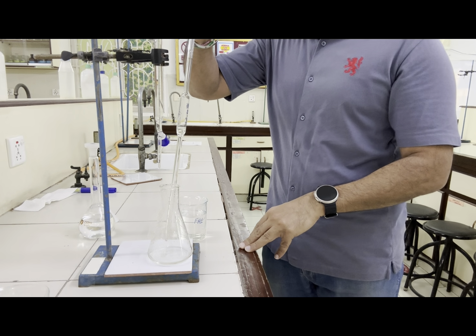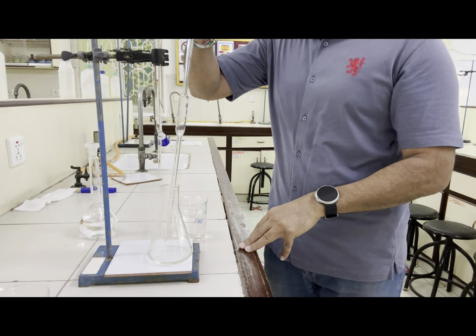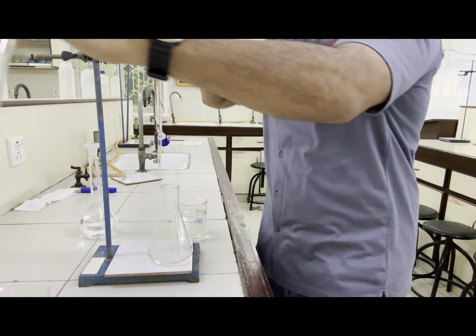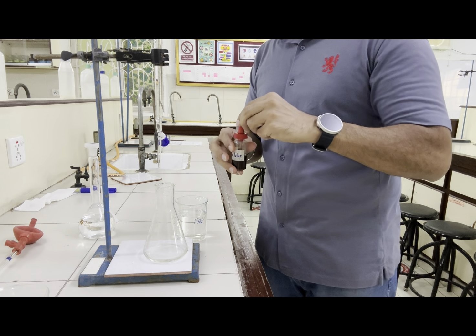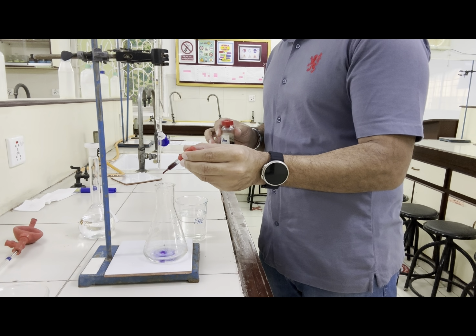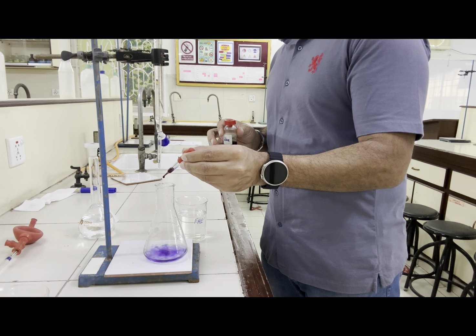Again, add 10 drops of bromophenol blue indicator. So here is our bromophenol blue indicator, 10 drops. 1, 2, 3, 4, 5, 6, 7, 8, 9, and 10.